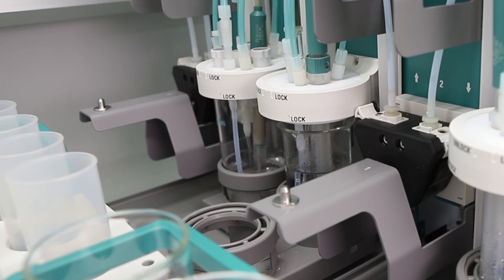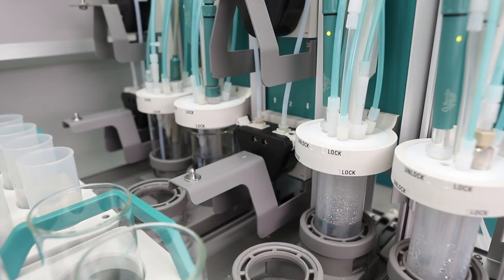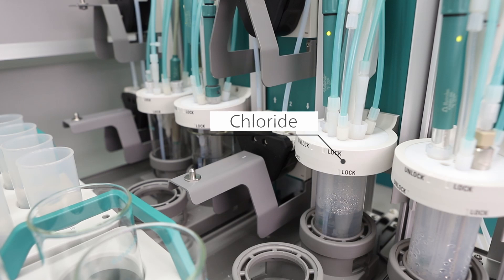Once the transfer to the alkalinity workstation has been finished, another 60 ml of sample solution is transferred to the chloride workstation equipped with a digital silver titrode.